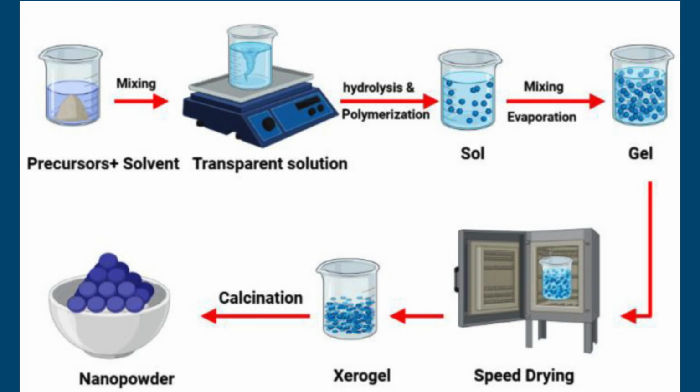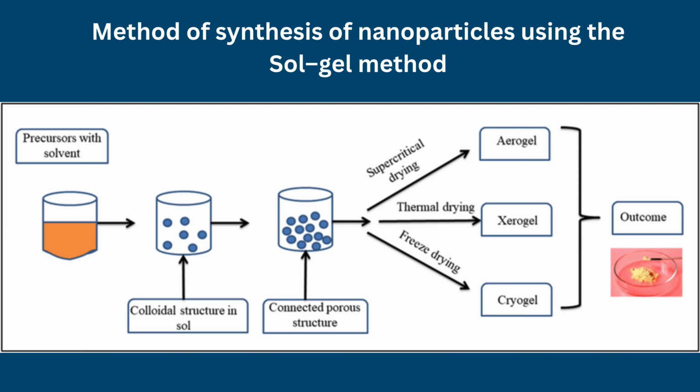The integration of these methods enables enhanced control over particle size, crystallinity, and electrochemical performance, particularly relevant for catalysis and energy storage applications. The Sol-gel process has emerged as a cornerstone technique in nanomaterials synthesis due to its ability to produce homogeneous materials at relatively low processing temperatures.